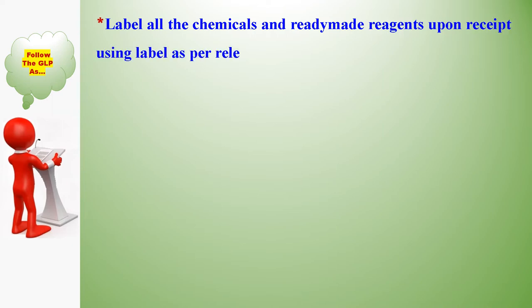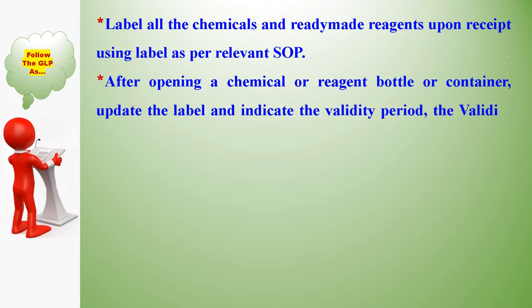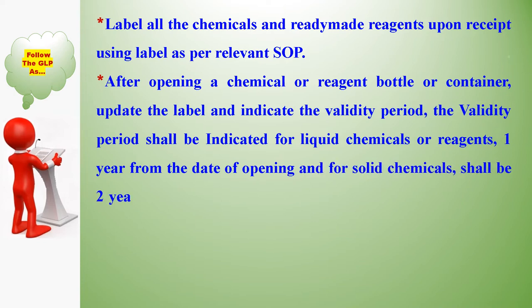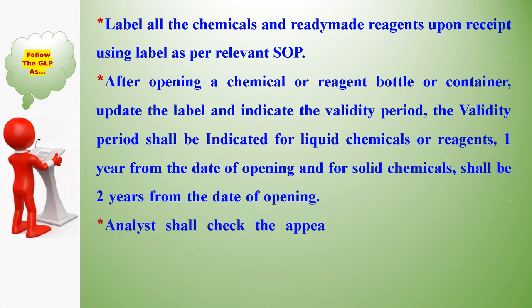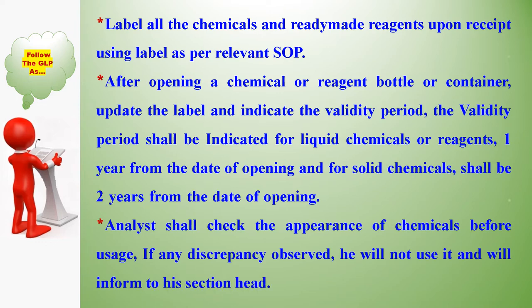Label all chemicals and ready-made reagents upon receipt using labels as per the relevant SOP. After opening a chemical or reagent bottle or container, update the label and indicate the validity period. The validity period shall be one year from the date of opening for liquid chemicals or reagents, and two years for solid chemicals. Analysts shall check the appearance of chemicals before usage; if any discrepancy is observed, do not use them and inform the section head.